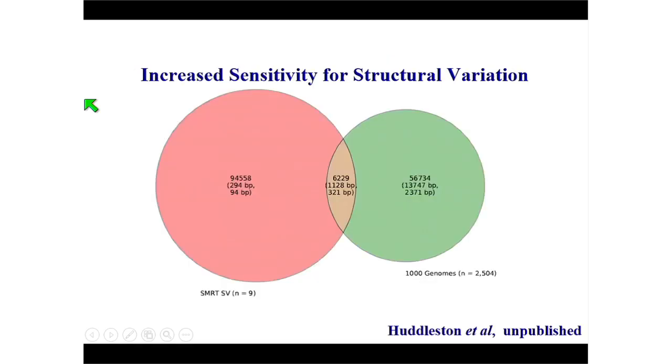This is showing you some unpublished data, and part of the reason I'm so excited. This represents here on the right work from our group and about 20 groups characterizing 2,500 genomes as part of the 1,000 Genomes project for about 4 years. So a paper came out at the end of last year summarizing about 60,000 structural variants with high confidence. And shown here is the number of events that you see and the average size of events as well as the median size of events.